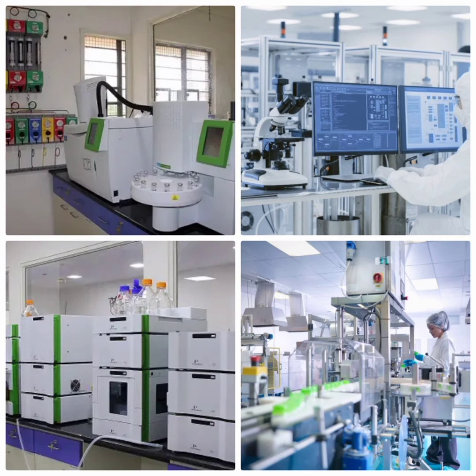Gradient and pressure are required. If it comes to detectors, we have seen that for GC, the detectors mainly used are FID for hydrocarbons, TCD as universal, GC-MS, and mass spectrometry, whereas for HPLC, the detectors are UV for light absorption, universal LC-MS, and mass spectrometry.